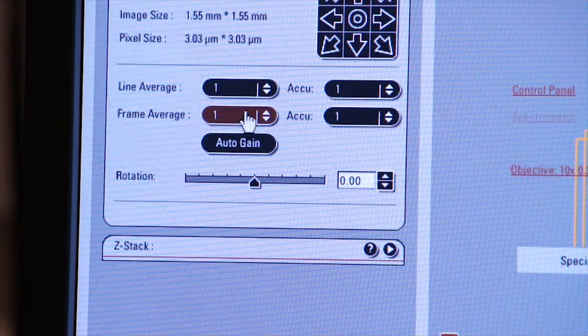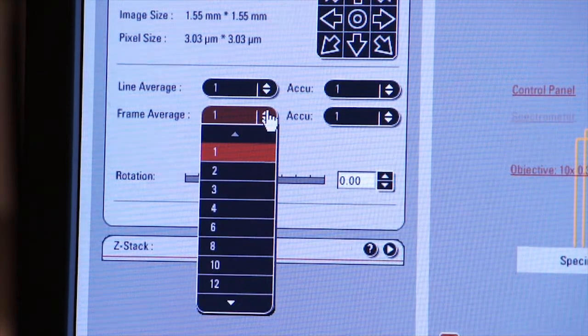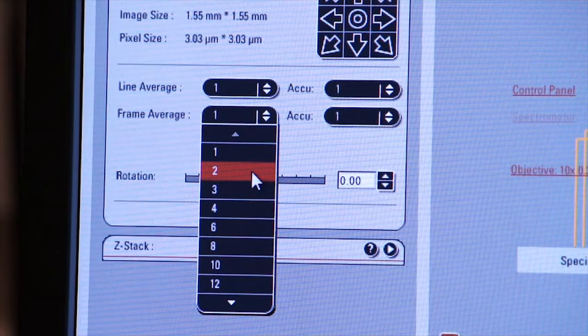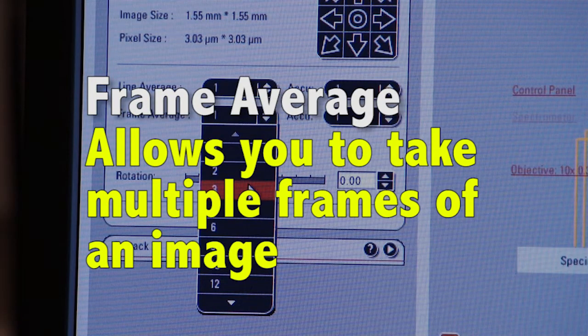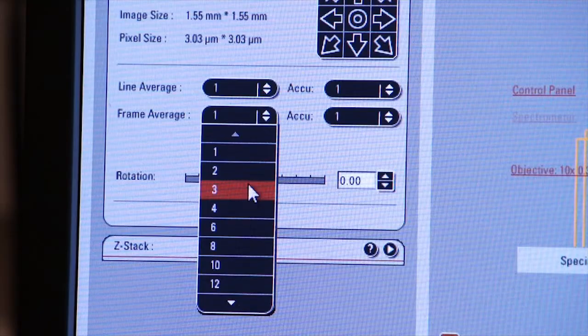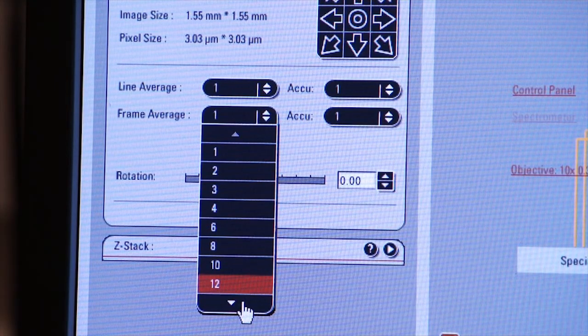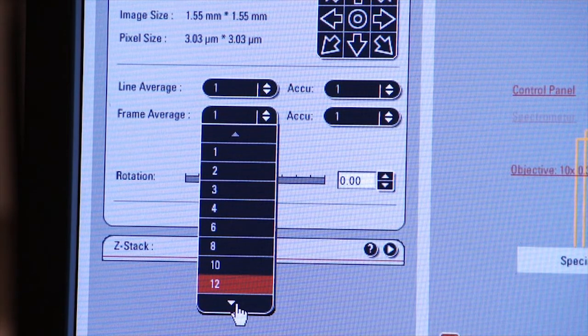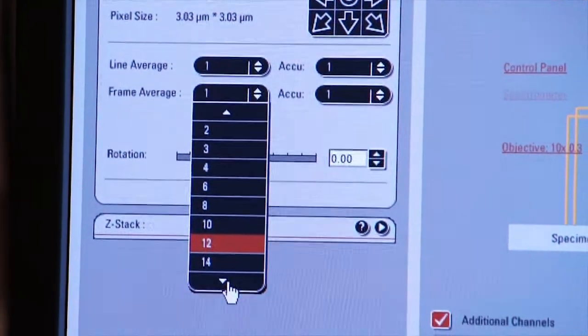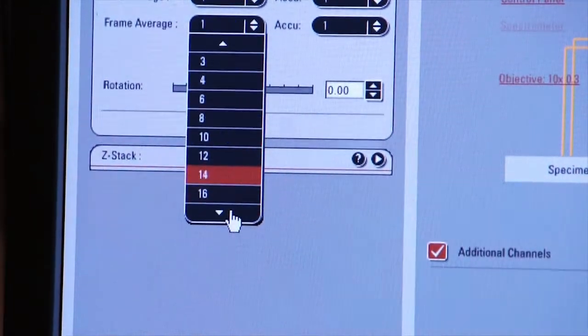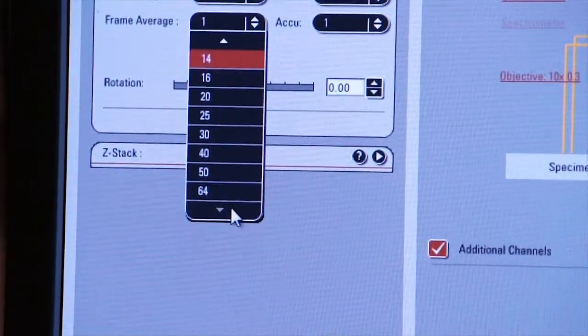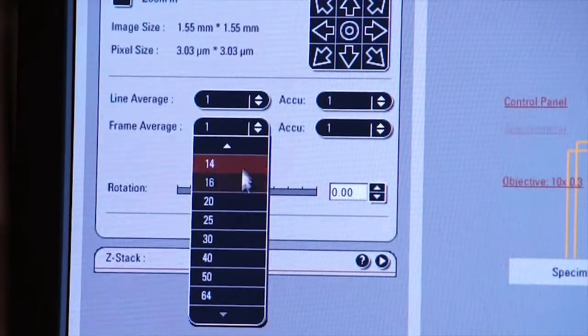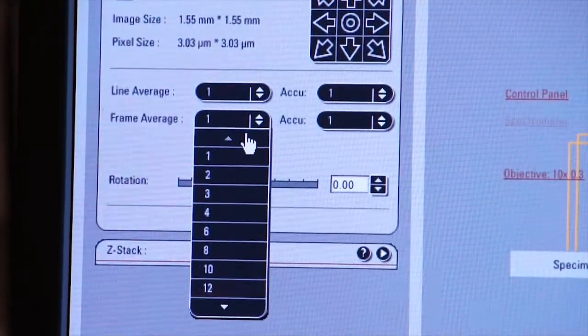You can also do frame averaging. What is frame averaging? Frame averaging allows you to take multiple frames. Two, three, four, twelve, or more. By the way, on both of these pull-down menus, you can specify by clicking on the bottom the number that you want to enter. If you keep clicking, you'll reach the end, and then there's a user point that allows you to enter the number of scans that you want to input.